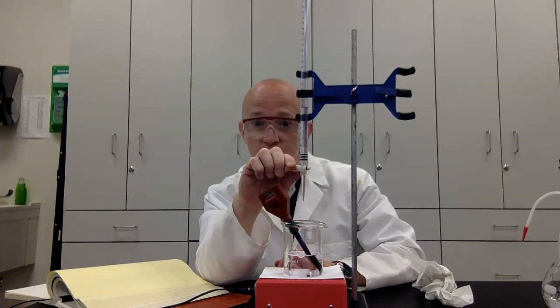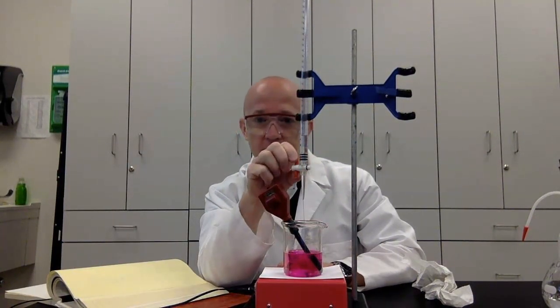I'll go ahead and just drain this out. That's a cool color, isn't it? Really pretty. A pretty magenta, pinkish color. That's how we know where to end.